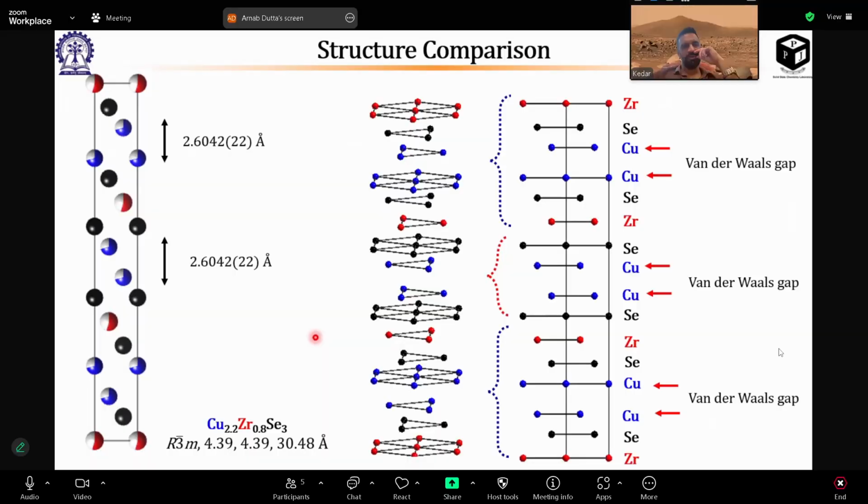I see. And this is not through the rapid Joule heating method anymore. No, this is just a programmable furnace that we have used for growing crystals, actually. Because without crystals, we are blind a little bit, especially for a new structure. If we don't have any three-dimensional data, it's very difficult to solve the structure from powder.